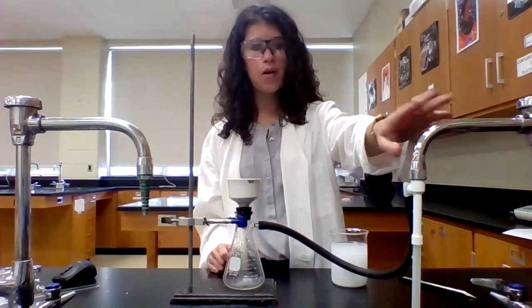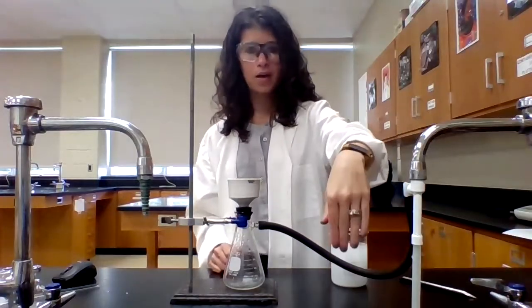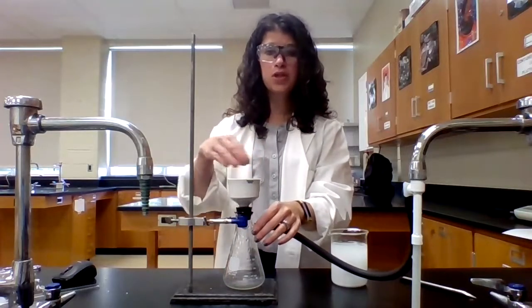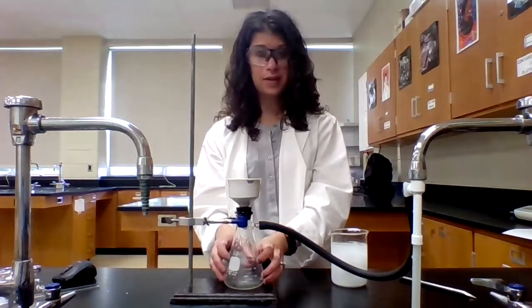This hose is connected to an aspirator on my benchtop sink. And so the point of this is that when I turn on the water here, the force of the water coming out of the sink is actually going to draw a vacuum. And that vacuum is going to take any solution that's up top here and suck it down into the filter flask.